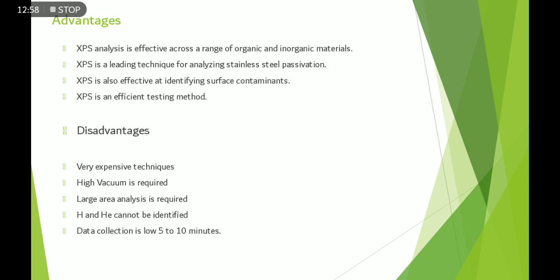Advantages and disadvantages. XPS is effective for analysis across a range of organic and inorganic materials. It is used for both organic and inorganic materials. It is a technique for analyzing stainless steel passivation, identifying surface contaminants, and testing methods.